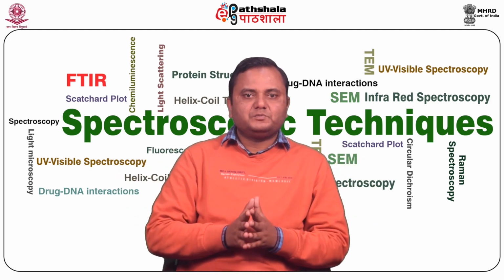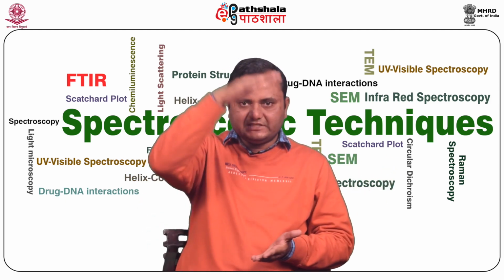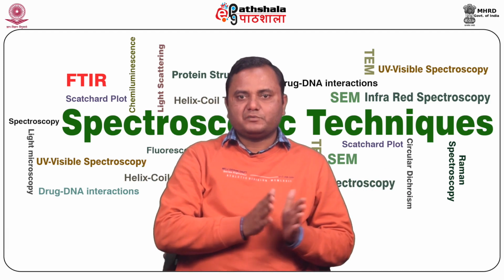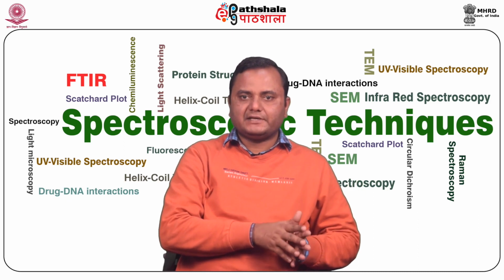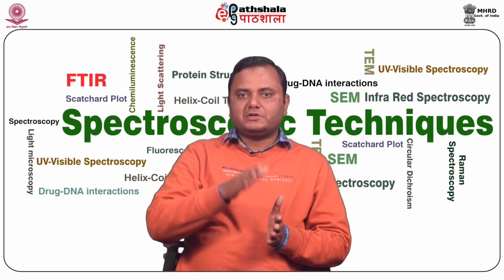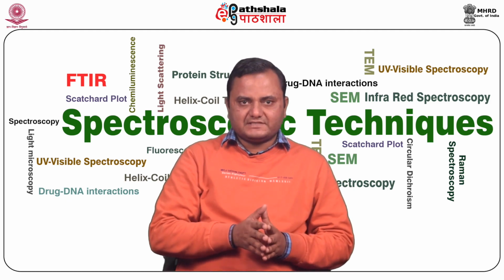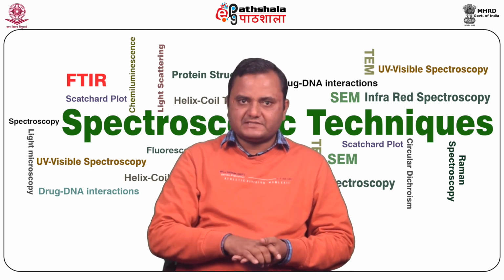The lambda max of tryptophan shifts to shorter wavelength, and the intensity at lambda max increases, as the polarity of the solvent decreases. If the lambda max is shifted to shorter wavelength when the protein is in a polar solvent, tryptophan must be internal. If the lambda max is shifted to shorter wavelength with the protein in a non-polar solvent, tryptophan is on the surface of the protein, or a conformational change has brought it to the surface.